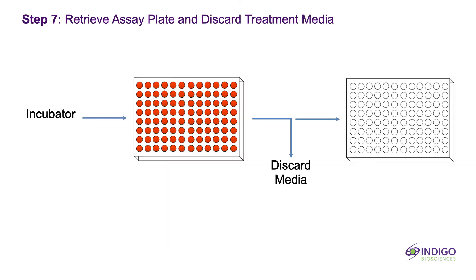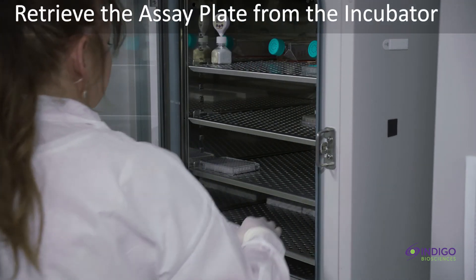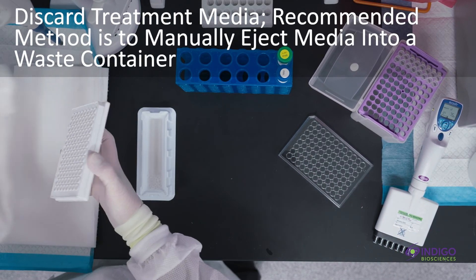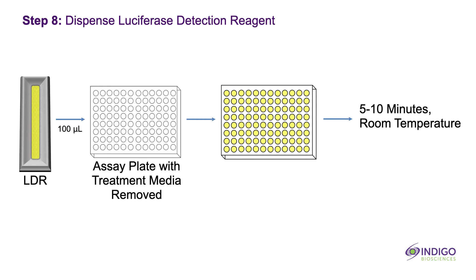Gently rock the basin. Take a plate from the incubator and discard the media contents. The recommended method is to manually eject the media contents into a waste container, then gently tap the inverted plate onto a clean absorbent paper towel to remove residual droplets. Cells will remain tightly adhered to well-bottoms. Dispense luciferase detection reagent into each well of the assay plate. Allow the assay plate to rest at room temperature out of direct light exposure for 5-10 minutes.